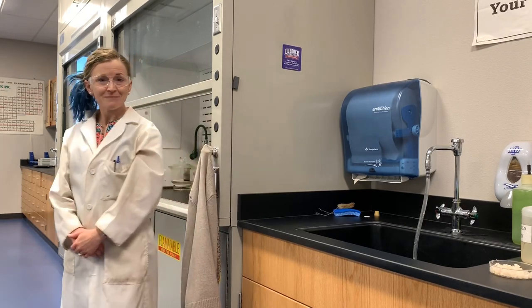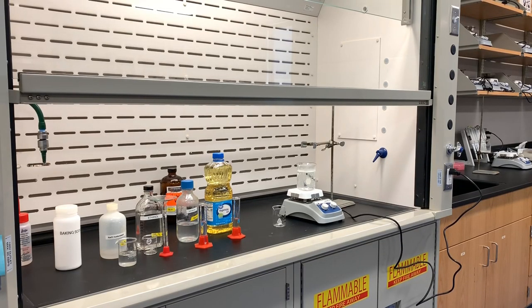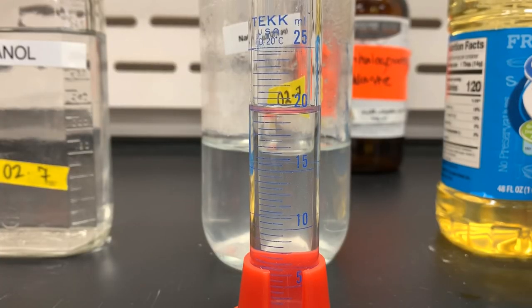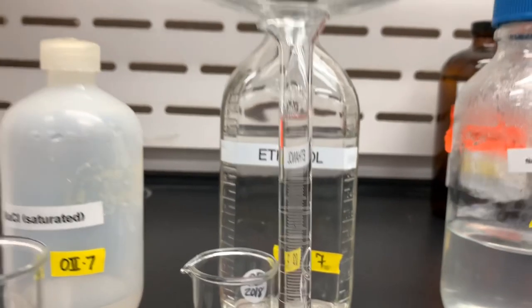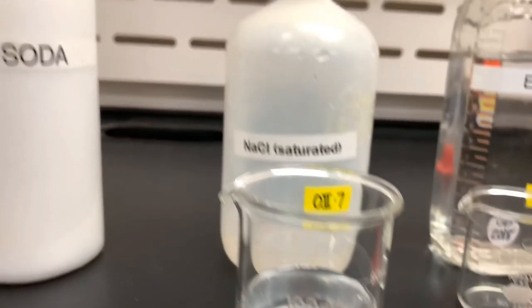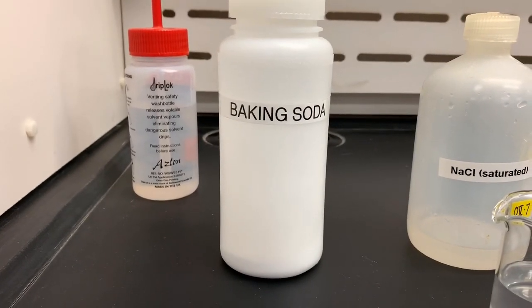Won't you join me to see how soap is made? To make soap we only need a few simple reagents and reactants. Be sure to write down the volumes and amounts in your observations as you see them on the screen. First we have vegetable oil, then 20% sodium hydroxide, which is also known as lye, ethanol, saturated sodium chloride, and then in the end we'll use baking soda to help neutralize our waste product.